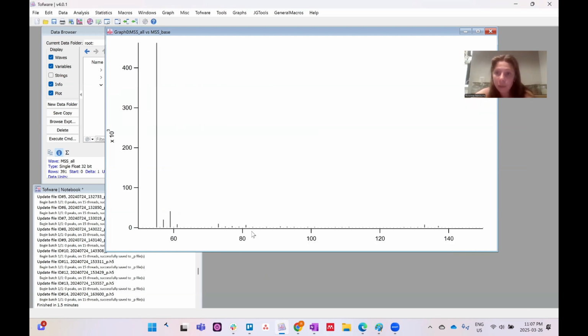There are a lot more things you can do from here to make your graph better for your homework. I would recommend doing axis labels. I would recommend considering how you can show the data in a way that is valuable. Right now you have 55 being really big. Is your idea to just delete 55 from your wave and note that in your answer that you did that?